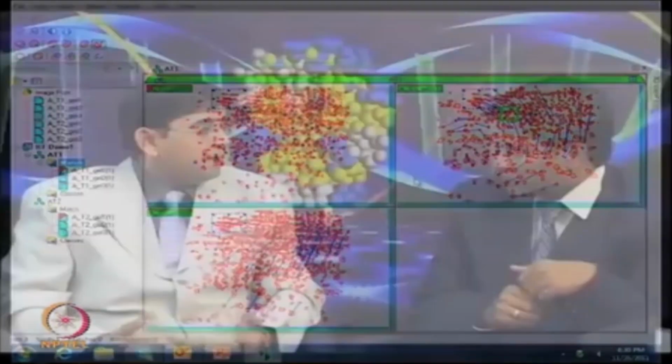So suppose instead of 3 replications you have 5 or 6 replications. Out of 5 or 6, one can remove that particular gel and take the remaining 5 gels. If during various experimental runs there are 1 or 2 gels which are very bad, which are going to affect the overall reproducibility, exactly. By looking at these parameters, one can decide, okay, out of 6 gels, maybe 1 is very bad and is going to affect our statistical parameters. So maybe one should remove that, and then select those which have a very good number of matches. Yes, that should be done.